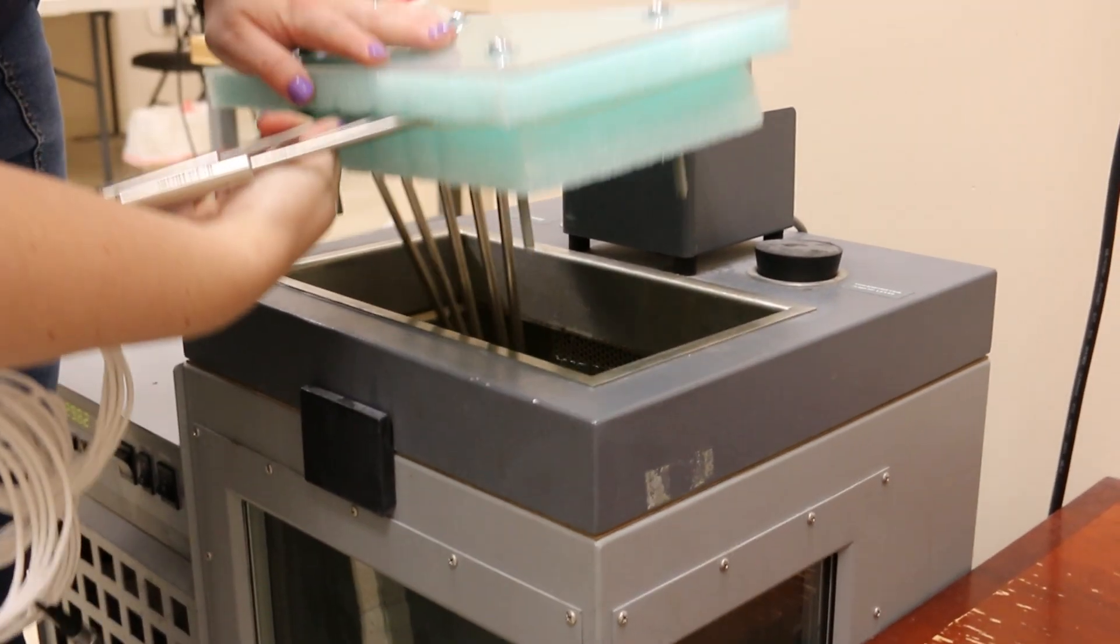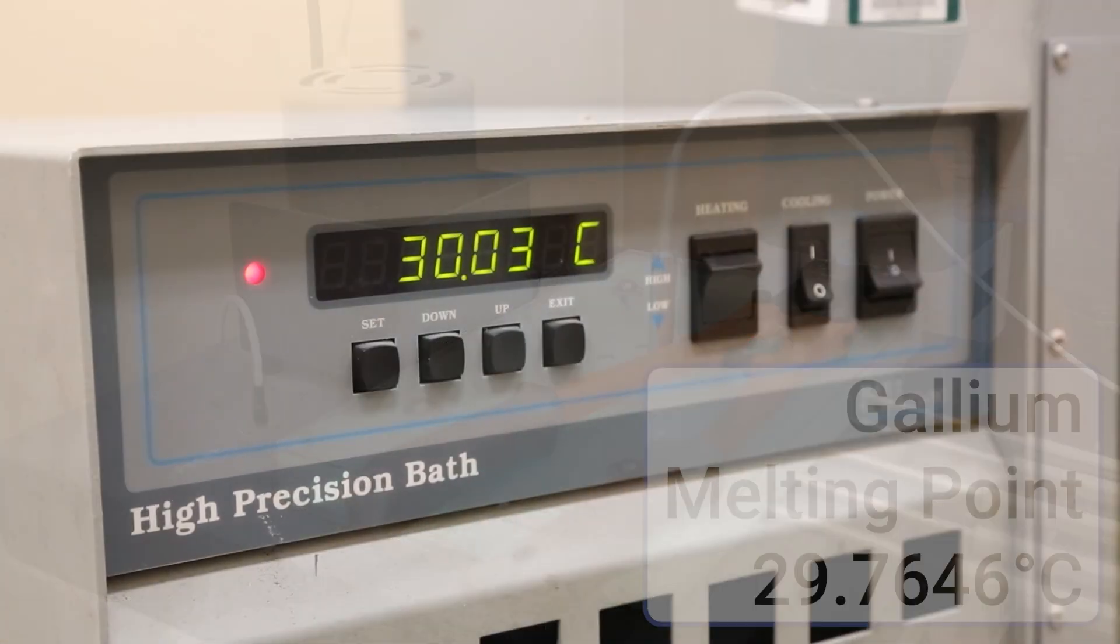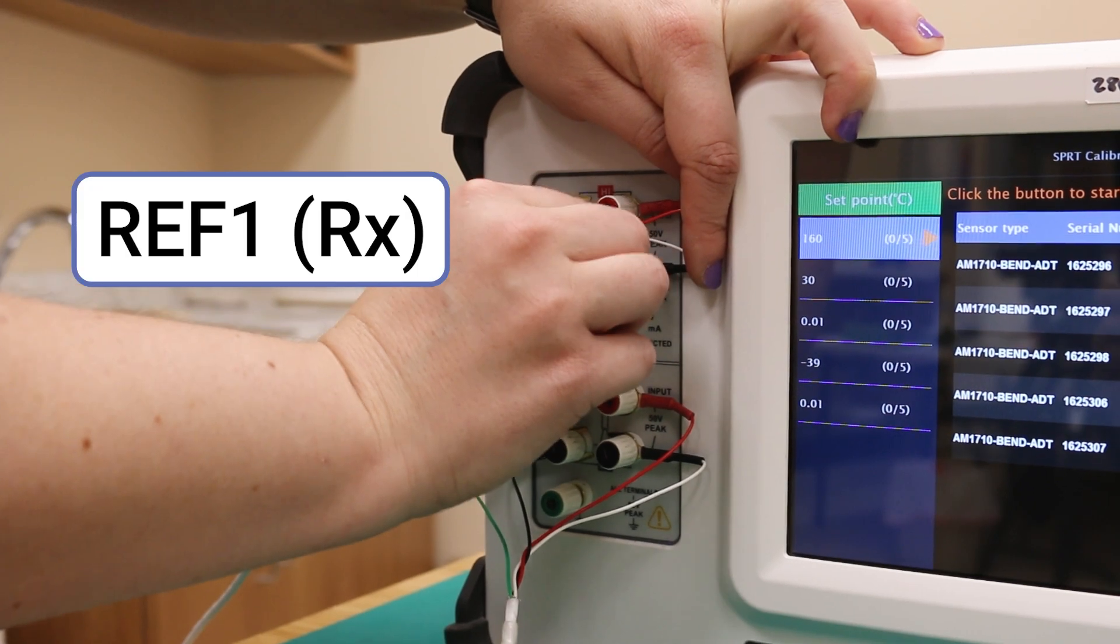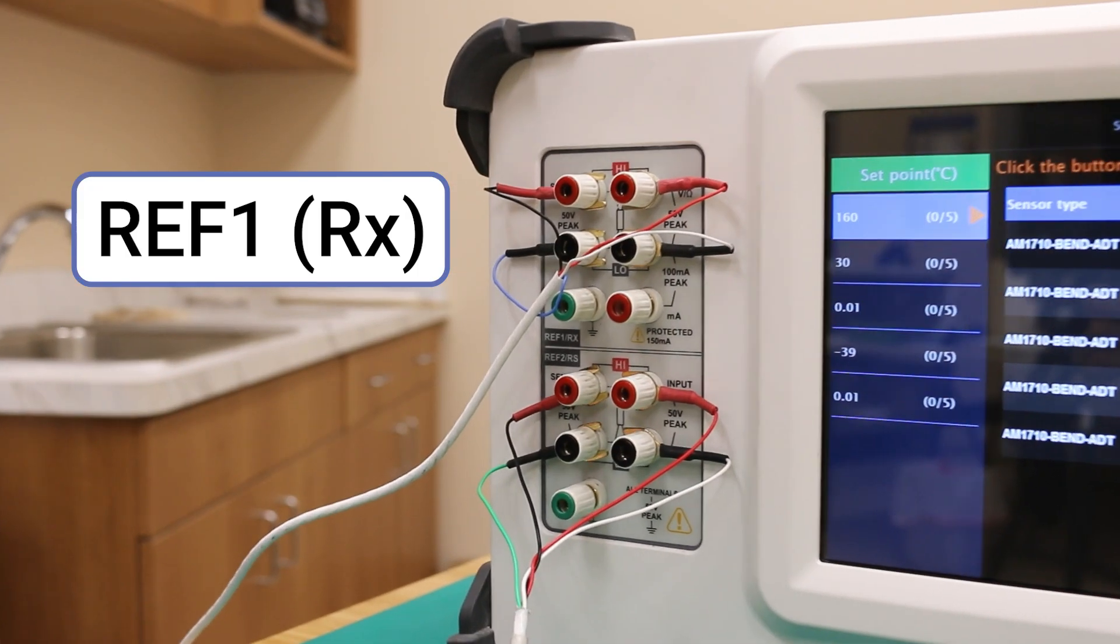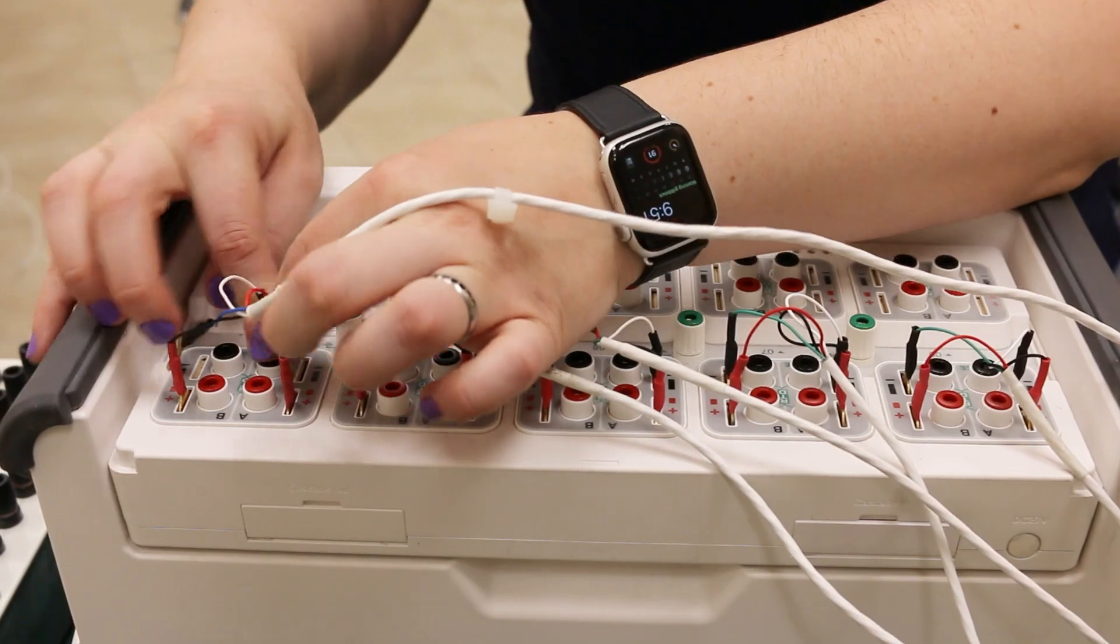Now we will add the DUTs and reference probe to the first bath. This bath is held at 30 degrees Celsius as a comparison point for the melting point of gallium. The reference probe will be attached to REF1 on the front of the 286. The DUT cables will be attached to ports 1-5 on the top of the device.